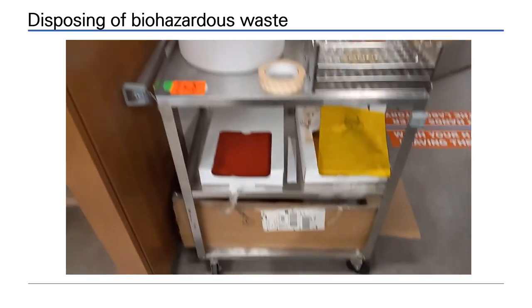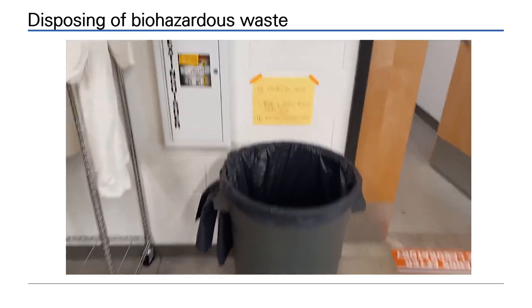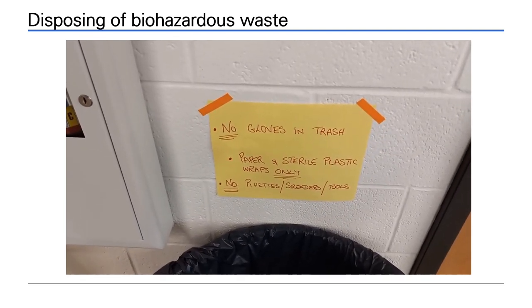Autoclave tape and autoclave bags are kept at the station. Any non-biohazard waste must go in the trash. Absolutely no gloves should enter the trash.